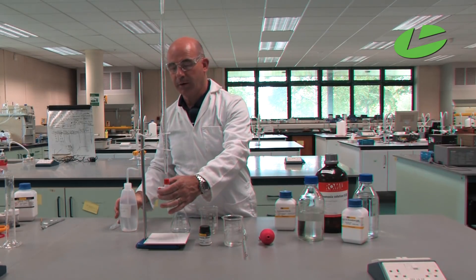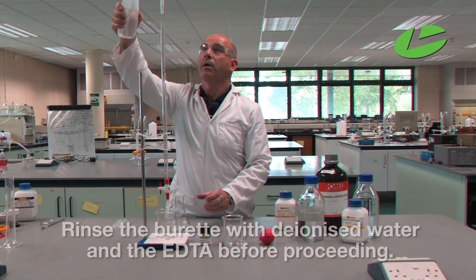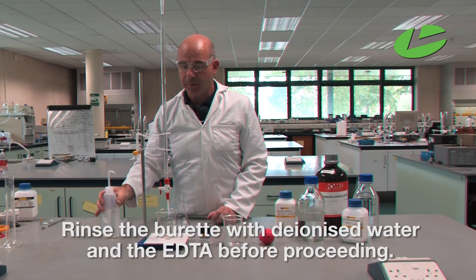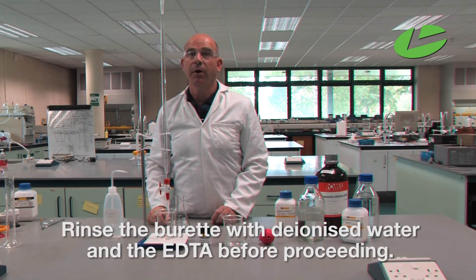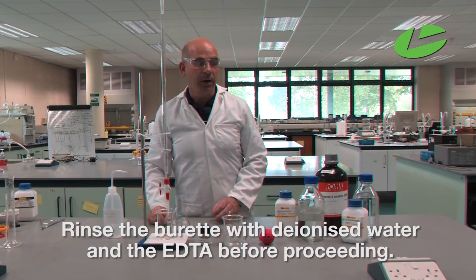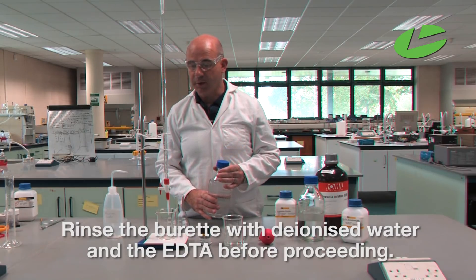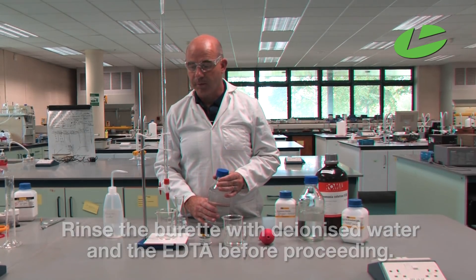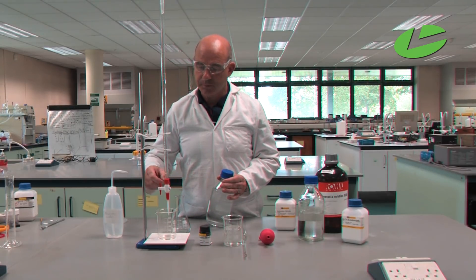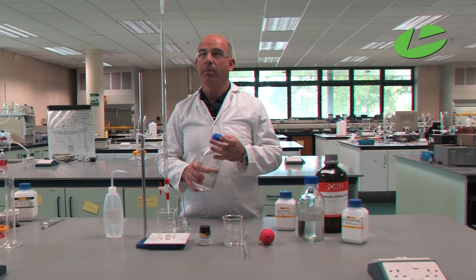Before starting, I'm going to rinse the burette — leave the tap open with a beaker underneath. This is deionised water to rinse out the burette. Before I can use the burette I also need to rinse it with the solution it's going to contain, which is the EDTA. So here I have my EDTA solution, and once the water has run out I will rinse with my EDTA solution.